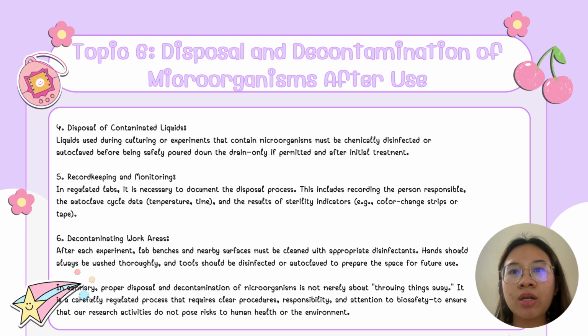In summary, proper disposal and decontamination of microorganisms is not merely about throwing things away. It is a carefully regulated process that requires clear procedures, responsibility, and attention to biosafety, to ensure that our research activities do not pose risks to human health or the environment.